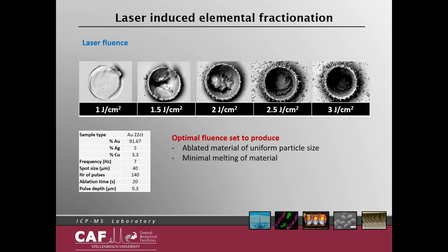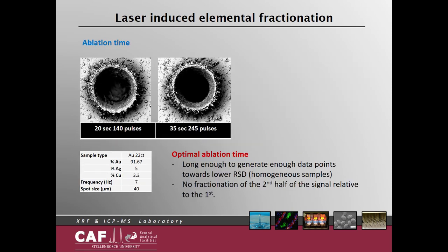The sample material determines the optimal fluence for uniform particle size and minimal melting of the sample. When looking at ablation of high-purity material, very low fluence resulted in a lot of melting but little material was vaporized for transfer to the ICP, while 2.5 to 3 joules per square centimeter fluence proved to be more optimal. The ablation time should be set long enough to generate sufficient data points — ideally at least 20 seconds when measuring many analytes. If it is too long, the laser crater gets very deep, like in a 35-second ablation, and the ablated material has difficulty being transported out of the crater.